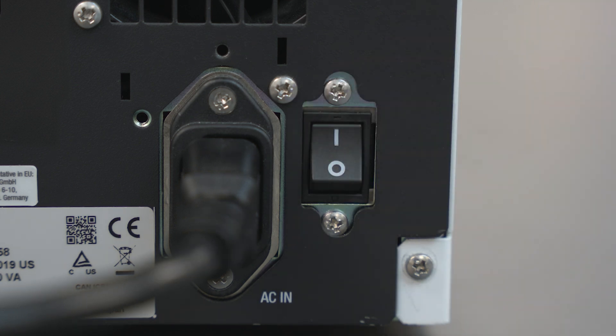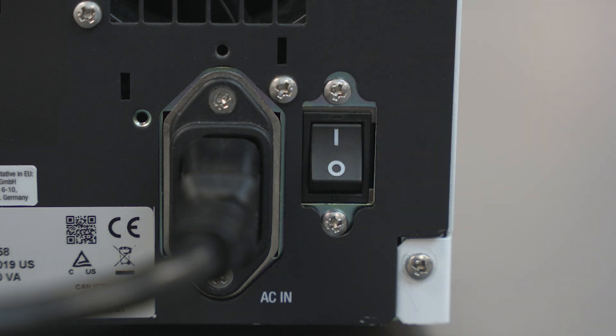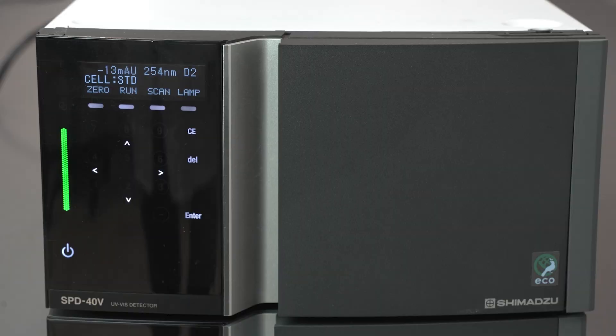Turn the main power switch located at the back of the detector on. Reset the lamp operating hours for the replaced lamp.